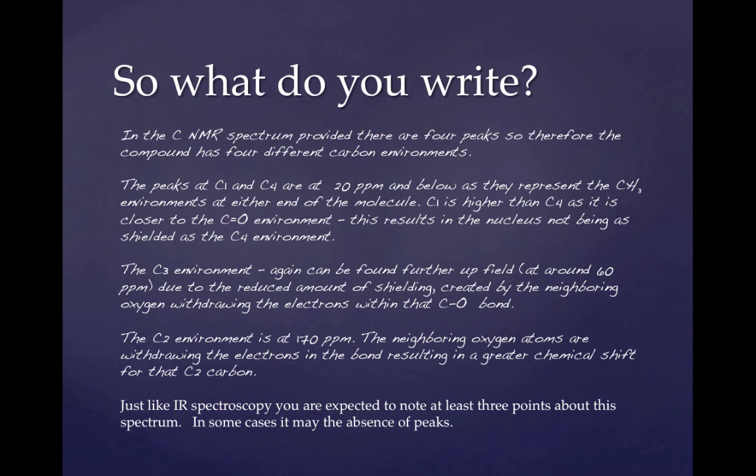Remember, just like infrared spectroscopy, you are expected to note at least 3 points about this spectrum, and in some cases, it may be the absence of peaks that you are noting.